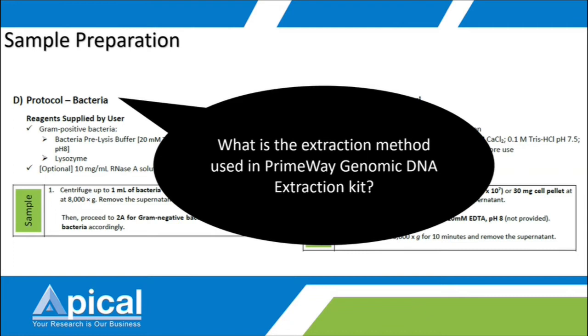Silica spin column method. Yes, Muhammad Adam is correct. Solid phase method. Yes, especially the column method. Yes, you can say it's correct also. Clarissa N. And spin column, Muhammad Rizal.